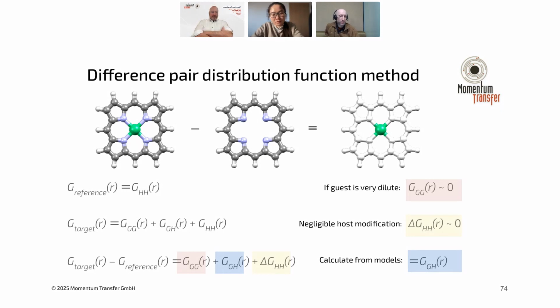And if I can assume that the host structure doesn't change, which, if I have a very dilute amount of the catalytic sites and the support material is subjected to the same synthesis and processing conditions, is oftentimes a sufficient assumption. Then for the local environment of the catalytic site, I can predict different possibilities for the binding coordination and make models for those, and I can test those models against the data.